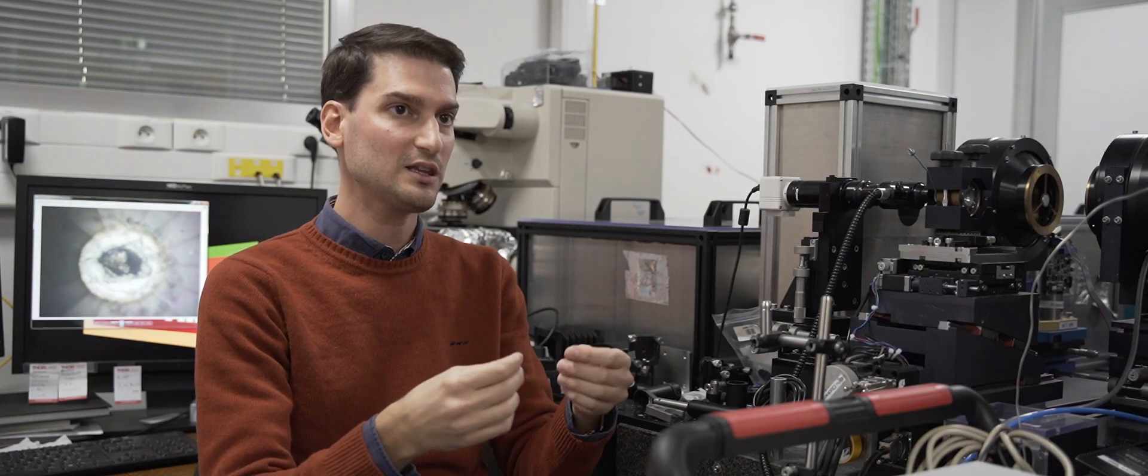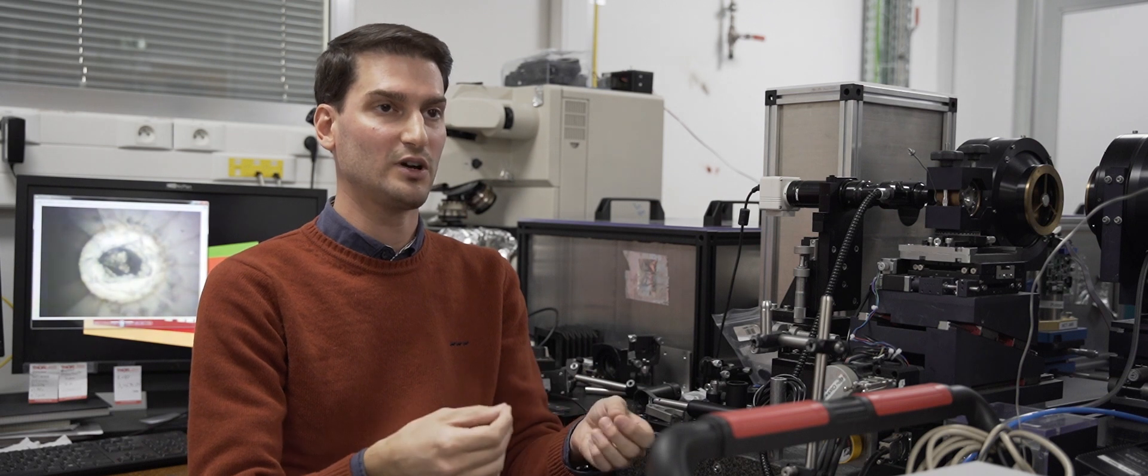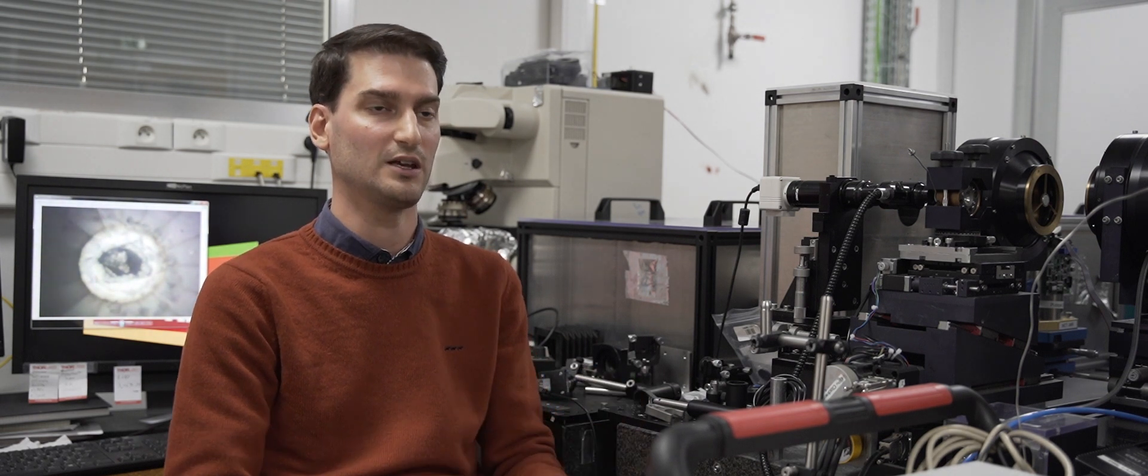So we can retrieve structural, chemical, but also electronic information from all kinds of samples from all kinds of fields.